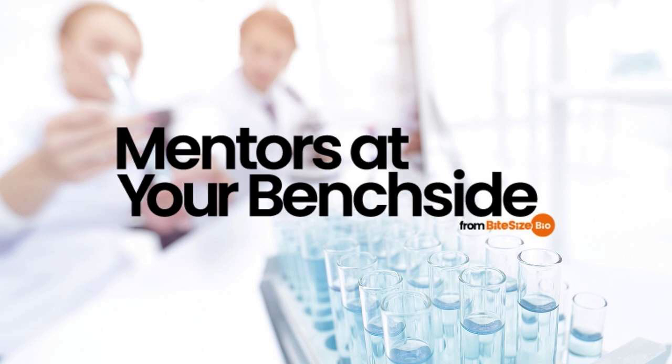Use cold solutions. Fixation should generally be done using a cold solution as the fixation process is exothermic. The heat liberated could damage your sample and the antigens you want to detect. Be gentle. Cells should be vortexed gently while adding fixatives to ensure good fixative penetration and reduce cell clumping, and add at least 1 ml of the fixative solution to a cell pellet.